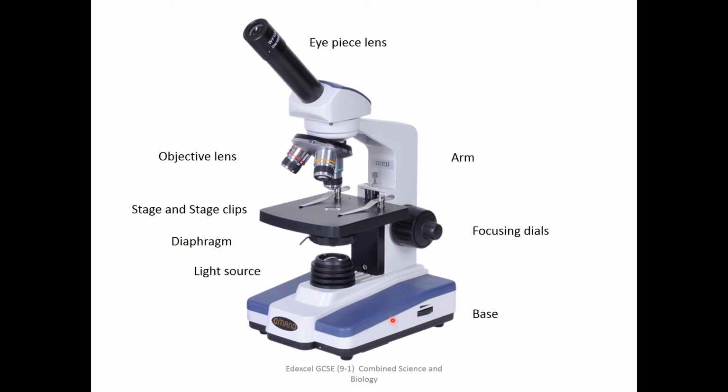The purpose of a microscope is to magnify objects. By that, I mean making things look bigger. It enables us to see things that we normally could not see with the naked eye.